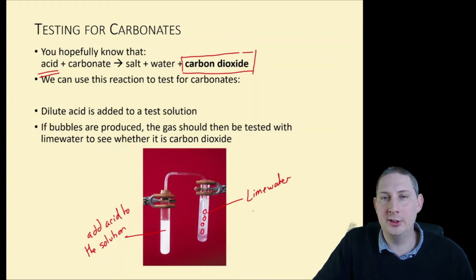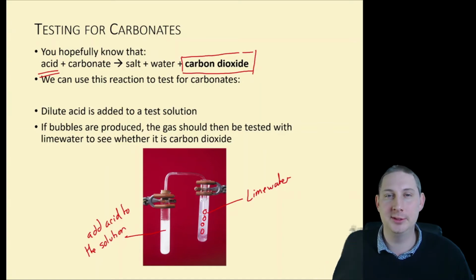If the lime water goes cloudy, the gas was carbon dioxide. If the gas is carbon dioxide, the initial sample must have contained a carbonate. And here is Mr. Reeves one final time doing that test for you.